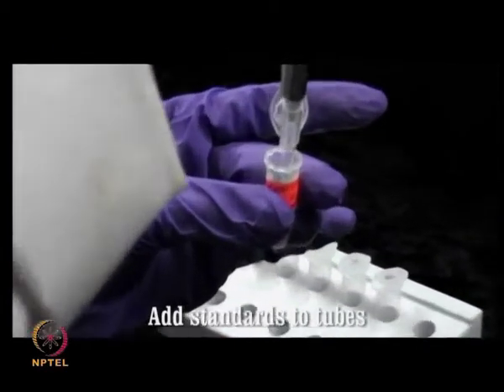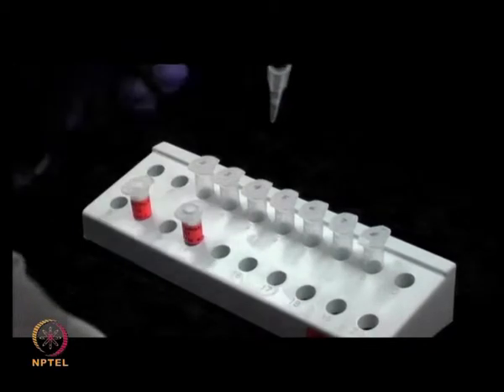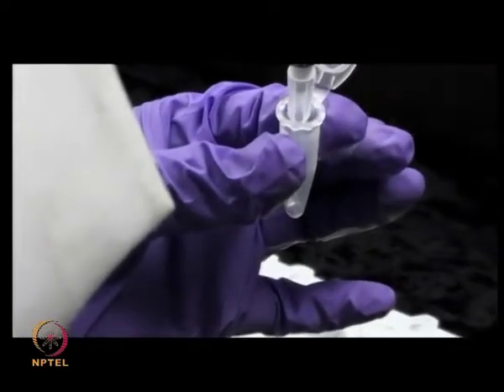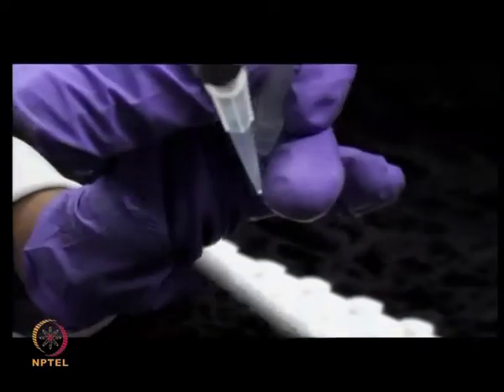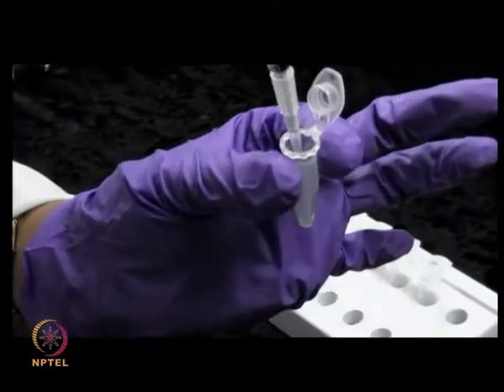Add an increasing concentration of standard protein sample to each of the designated tubes. Bovine serum albumin is often used as a standard. Then add the unknown protein sample whose concentration is to be determined to the appropriately labeled tube. Dilute all the samples uniformly using the sample buffer.